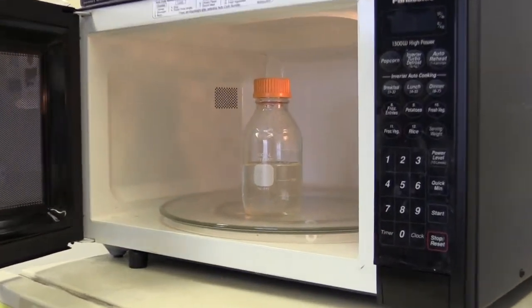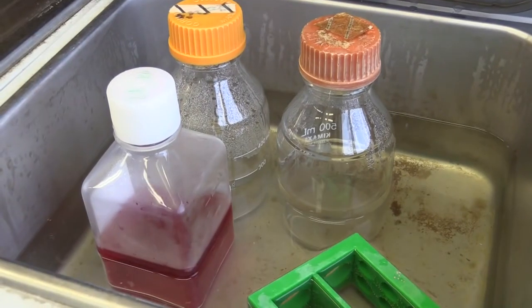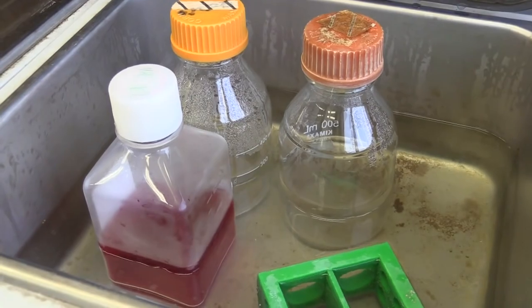For a plaque assay, we also add agar to the cell culture medium. At room temperature, agar is solid, so we put our agar stock in a microwave to melt it, and then we put the bottle of melted agar in a 45 degrees Celsius water bath, at which temperature the agar remains liquid, but it's not too hot so that it won't damage cells when we add it to them.